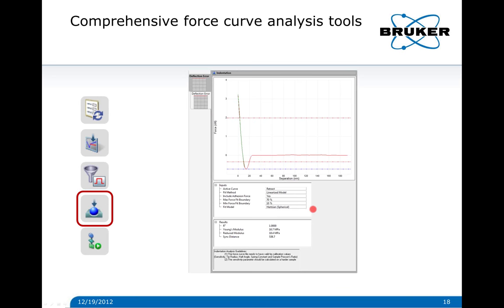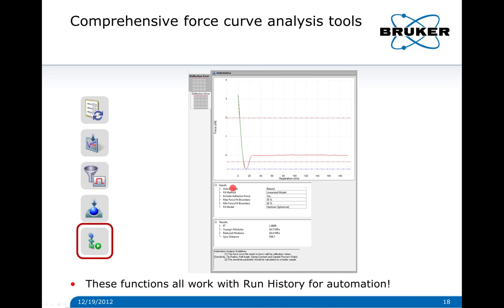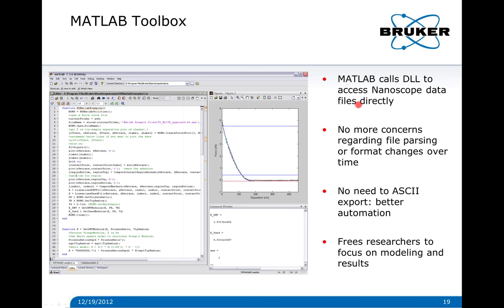For fitting, we're using a linearized Hertzian model and including the adhesion force marked by a blue line — automatically detecting this contact point. We can adjust the part of the curve we'd like to have fit, and we get out the Young's modulus, reduced modulus, and R-squared. All of this works with the run history function, so you can automate through batch processing and do a thousand curves if you want. It basically just takes the time for the system to do the computation.